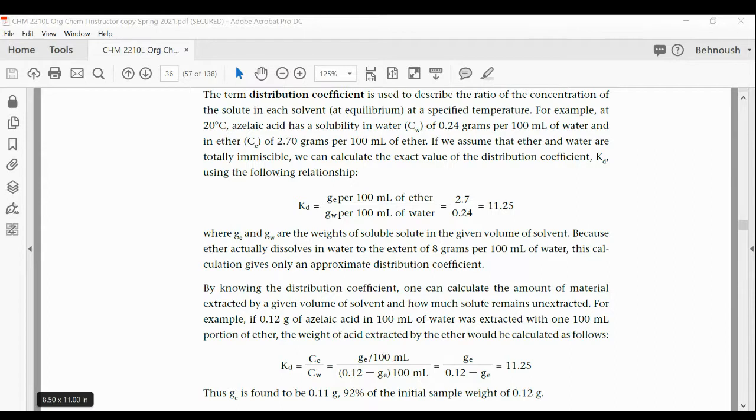That's the first condition. And then it has to have low boiling point. It should be able to dissolve both neutral compound, acidic, and basic compounds. So it should have some polarity, but it cannot be too polar. And the expense is always a concern. Yes. Has to have low boiling point, so your recovery is going to be faster, and you don't want it too high. Extraction solvent should have a favorable distribution coefficient for the compound being extracted. Very good, and it should be safe.